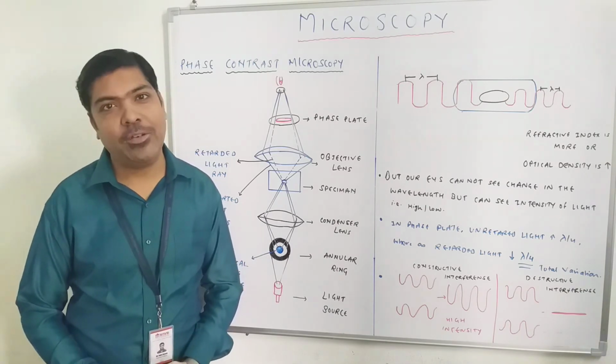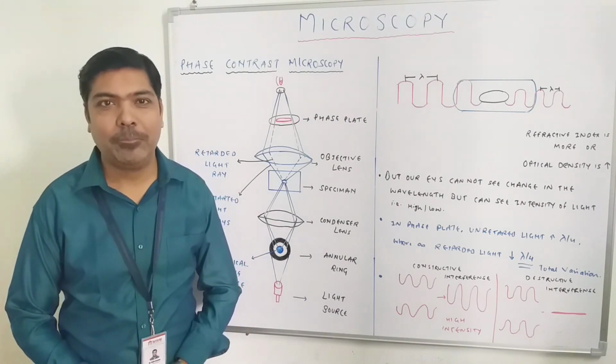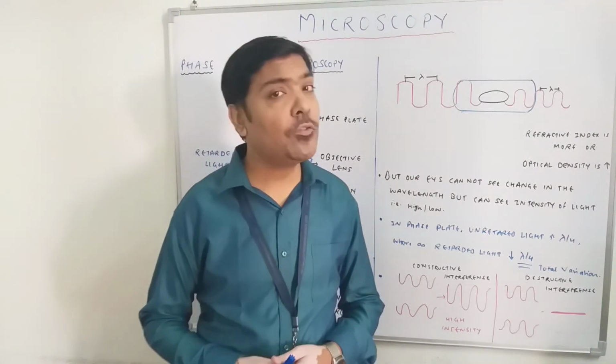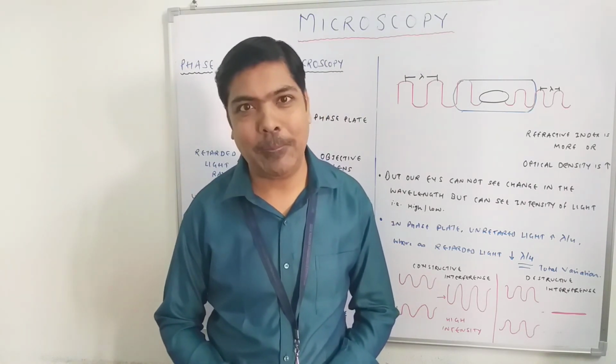In today's video lecture, we'll discuss phase contrast microscopy. Phase contrast microscopy has a very wide application and many advantages compared to bright field or any other class of microscopy.